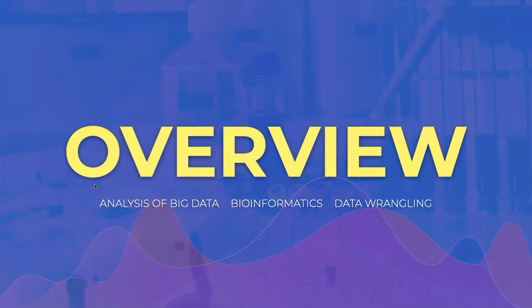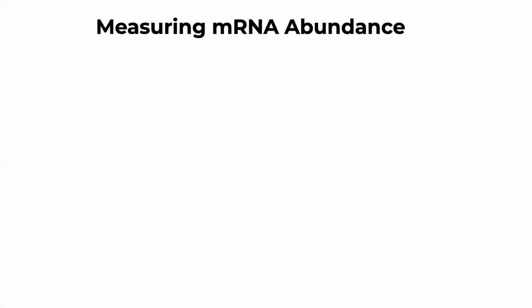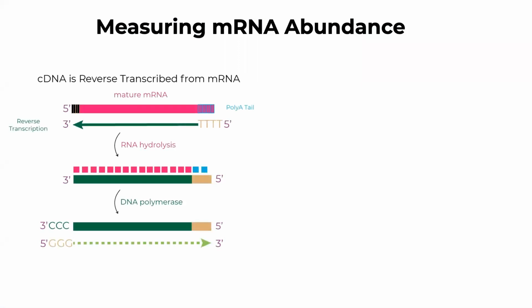Let's talk about what we discussed last time, which was the RNA-seq pipeline. So let's just see how everyone remembers what we talked about and what it is that we were trying to measure. So measuring mRNA abundance in a sample could be done with a number of different technologies.